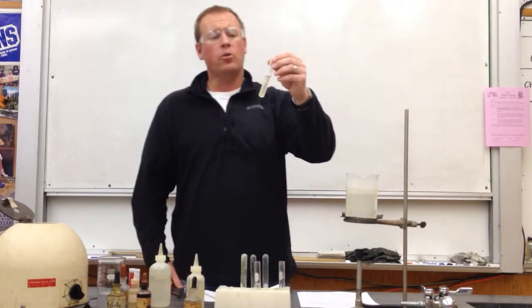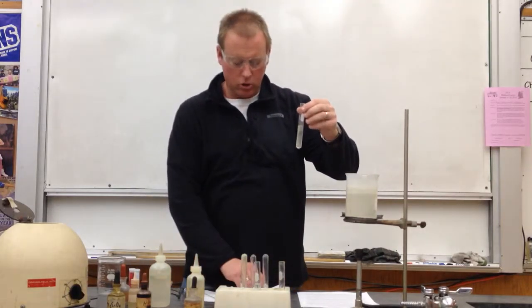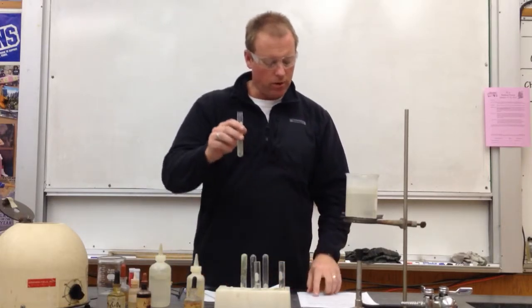Okay, well that took about another minute or so, and you probably didn't want to sit there and watch me do that, but I continued to add more hydrochloric acid until my litmus paper turned from blue to red. So it is indeed acidic now, and we can continue on.